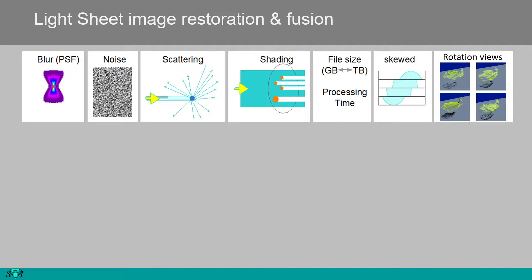Lightsheet images suffer from a number of image-degrading effects, often more severely so than other microscopic techniques, because large and dense objects are being imaged. Examples are blur, noise, scattering of light and shading, when the object or specific parts of it are not transparent. Lightsheet images typically result in large files.